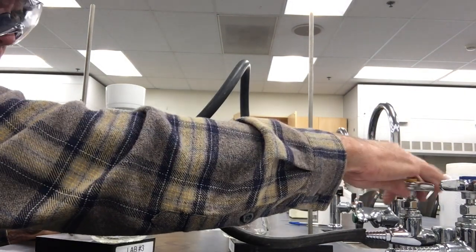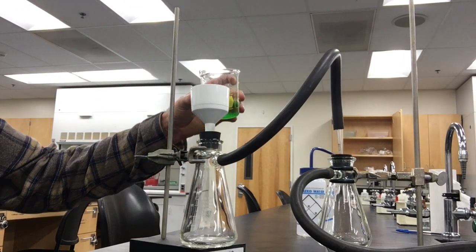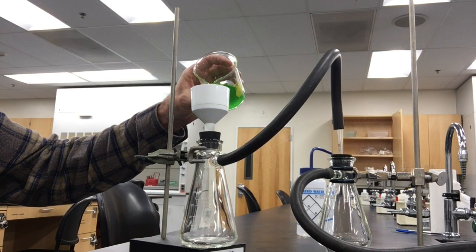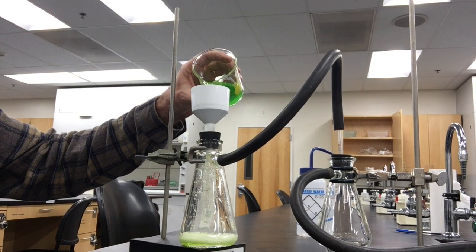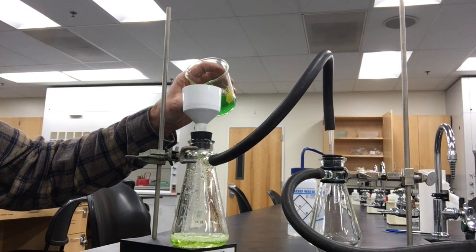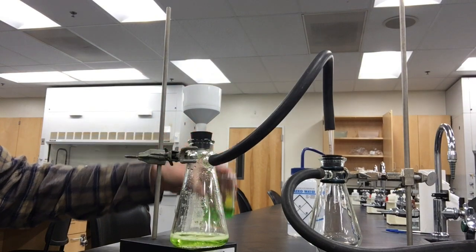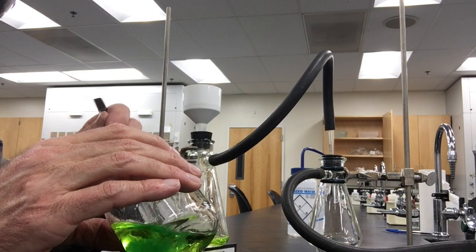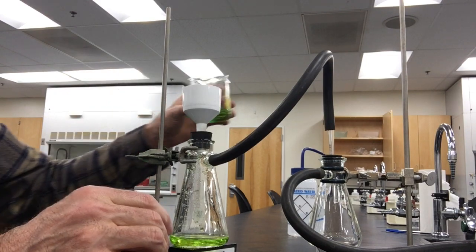I'm going to turn it on. Maybe you can hear it, and I'm going to pour one of your crystals through. Maybe you guessed who it was already. You can see the supernatant dripping through, and some of it did go into my trap — so it's a good thing I have that. Now I'm breaking up the crystals so they'll go into the filtering apparatus.